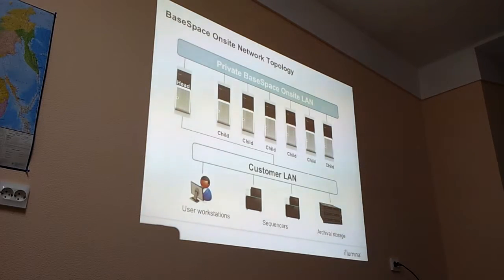Apparently the data transfer to the cloud also had a problem. Yeah, so maybe it's the speed. At least there is this symbol that says that there is some problem with the connection, and it's always good to have a local copy.